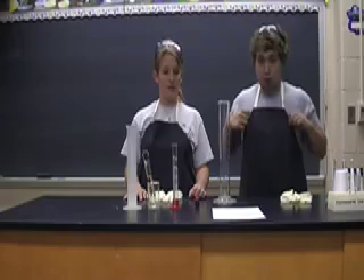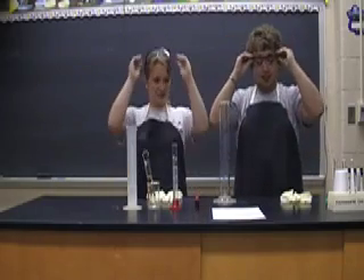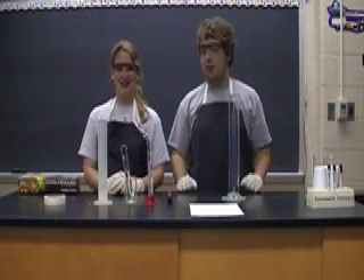Now we are going to go ahead and do the reaction. We're ready for the larger reaction. As you can see, we already have on our aprons, we have our safety goggles, and we're going to put on gloves now. Now that we have our glasses, our gloves, and our aprons, what we're going to do is go and get our chemicals.